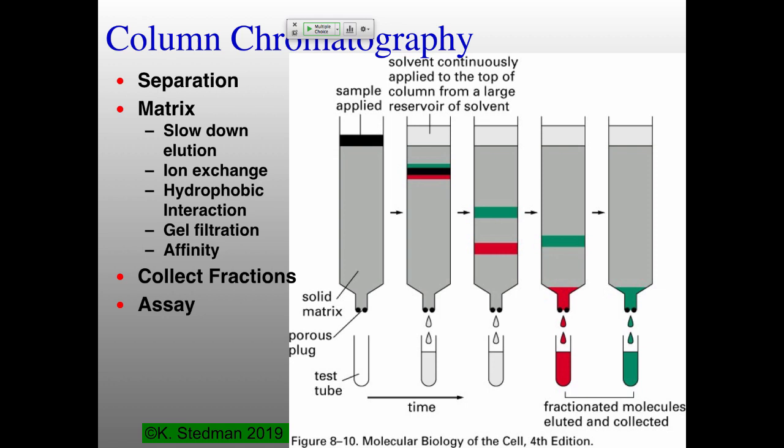That's going to be charge. Based on the charge of your protein, going to be those charged amino acids, which are the lysines, arginines, glutamates, and aspartates on the outside of your protein, plus whatever else is there, but usually it's going to be those, and exactly how they're interacting with other ions. You can also have what's called a hydrophobic interaction column, where you look at how much hydrophobicity is exposed on the outside of your protein. More hydrophobic is going to be maintained more, less hydrophobic is going to be maintained less.